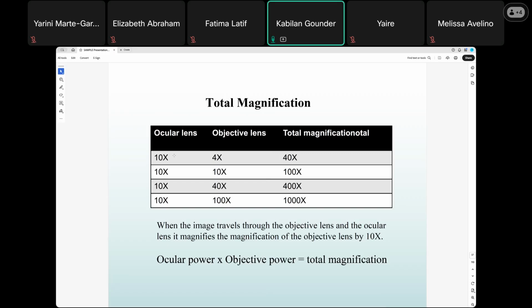As an observer, you must know what kind of objective you use. When you take a picture, and go to software, you can maybe increase the image size because you want to see more detail. But the manipulation changes the real size of your samples. For that reason, you need to know the original magnification, the one which you took during the process.